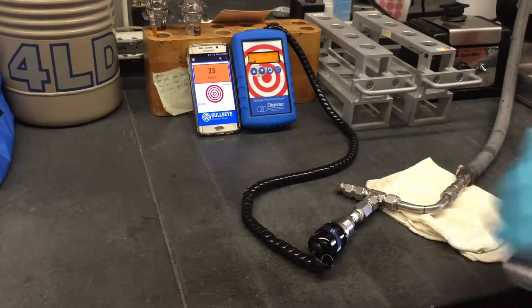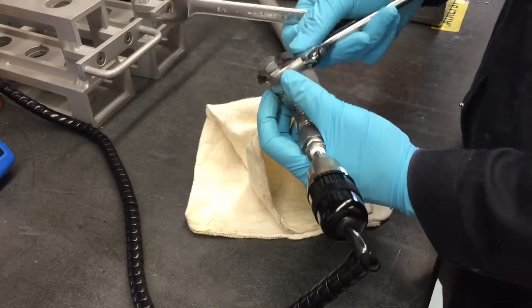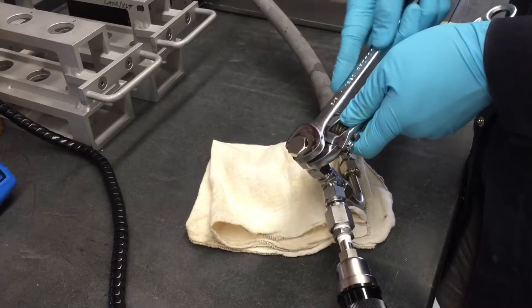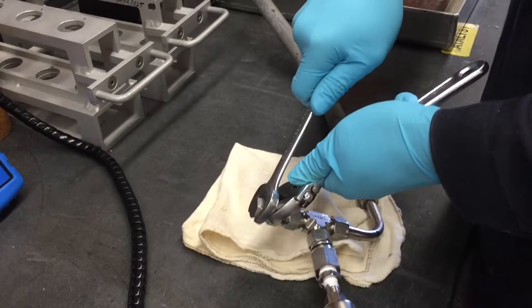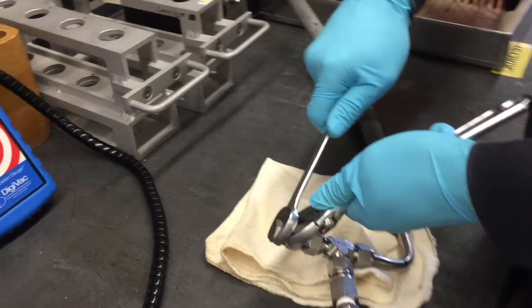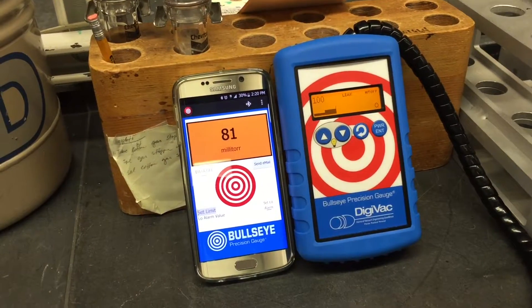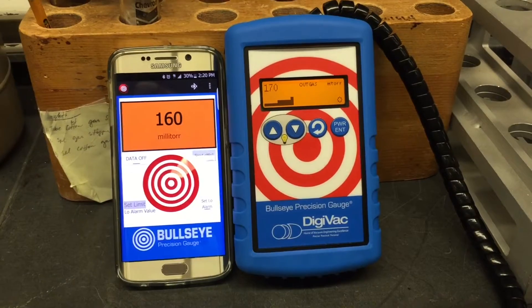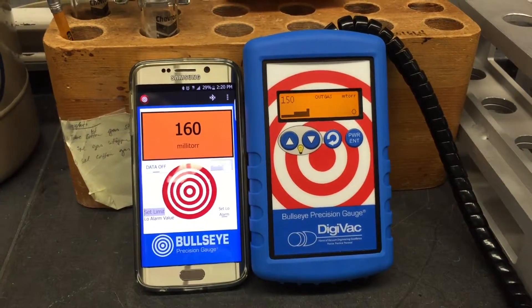Now I'm going to create a leak right here. And now you can see that it's increasing. We're going to let it stabilize for about 5 minutes and we'll come back to you.